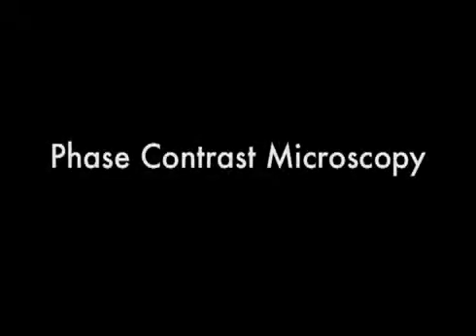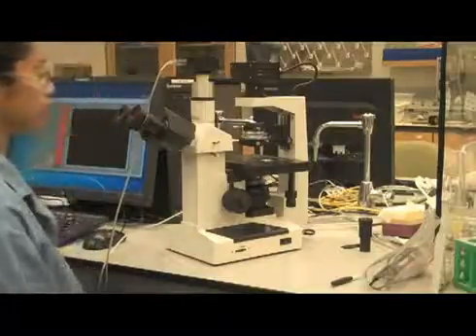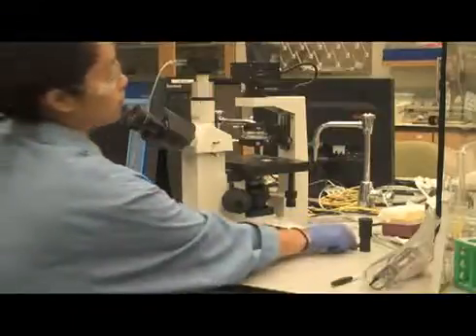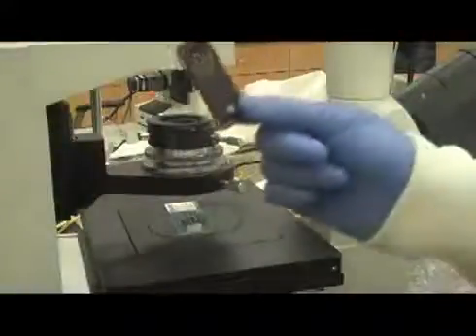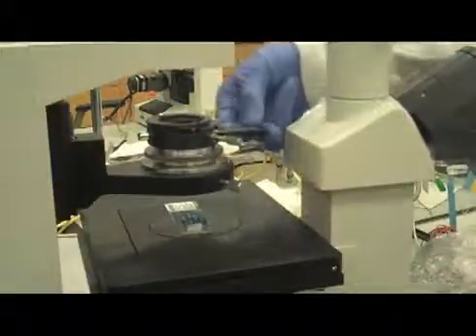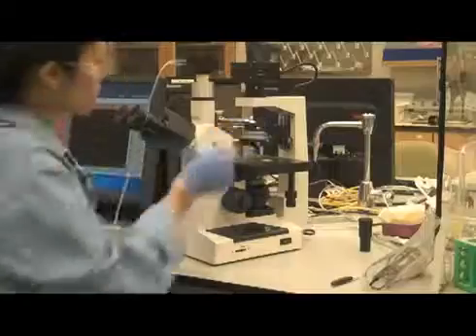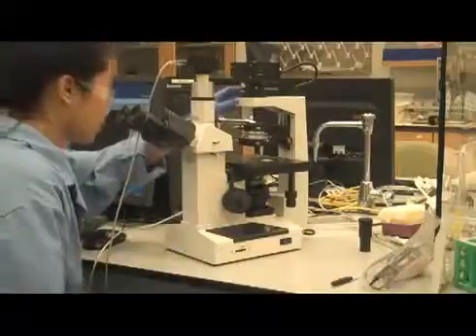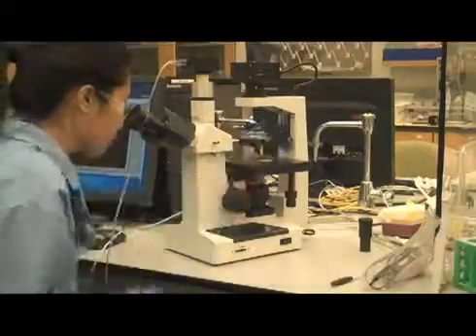If you would like to use phase contrast microscopy, simply follow these five additional steps immediately after focusing your specimen in bright field. Step 10: Locate the annular diaphragm slab, which should be sitting next to or around the microscope station. Insert this piece into the annular diaphragm slot and make sure to turn the aperture dial to maximum aperture by rotating it counterclockwise.